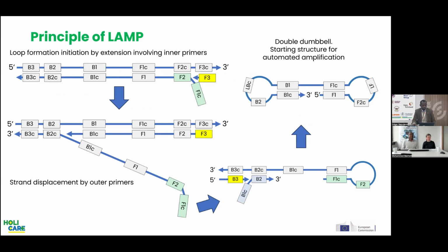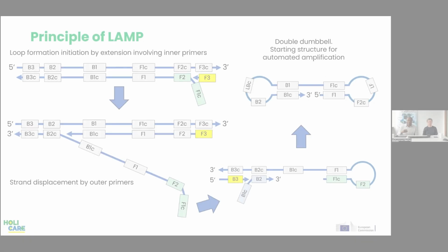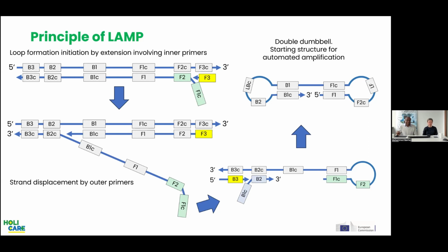Very shortly, on the principle of the LAMP amplification. And as mentioned previously, the LAMP amplification works. Yes, and this is the most complicated slide in the whole presentation, but I will try to manage it now because it just summarizes how the LAMP works. Usually the reaction is initiated. Do you see my mouse? We have here, for example, a target DNA strand.